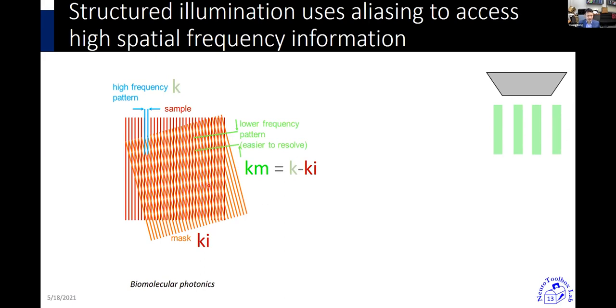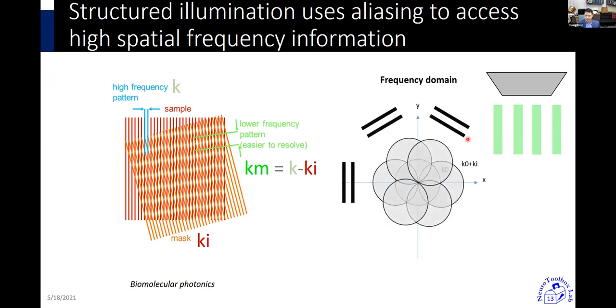So this haze is essentially this pattern of a thin stripe of my shirt against some pattern of pixels on the camera, okay? But it turns out if we can apply very high spatial frequency gratings into the sample, what that really does is that it can demodulate high frequency spatial information back to the baseband that can be captured by our camera, just like how the webcam is capturing my image right now. And this higher spatial frequency information leads to overall smaller spatial extent. This is what we learned from Transforms 101.